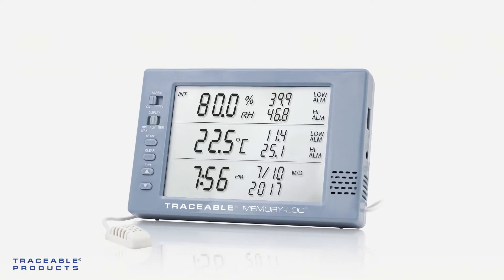Once an alarm has been triggered, the corresponding parameter will flash on the LCD, and an alarm will beep. The alarm will continue to beep for 60 seconds, and then beep every 15 seconds.